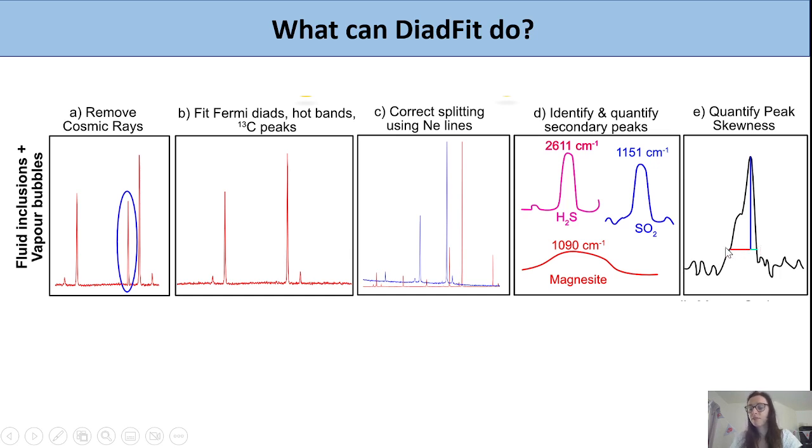This can be really important if you've collected data below the critical temperature of CO2, below about 33 degrees. If you have a high-density inclusion that's liquid and vapor at room temperature, you'll get a mixed spectra. It's really important to identify this because if you're just fitting a single peak and your inclusions are of that density, you can end up with the wrong splitting.